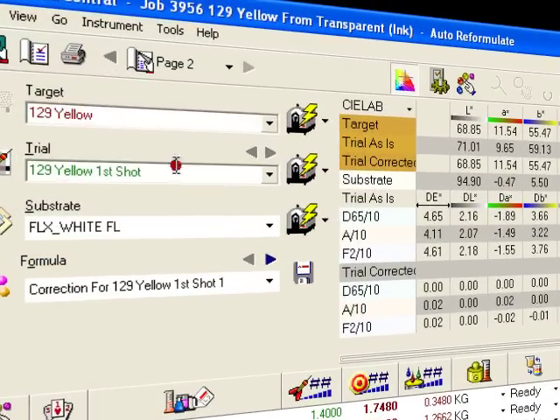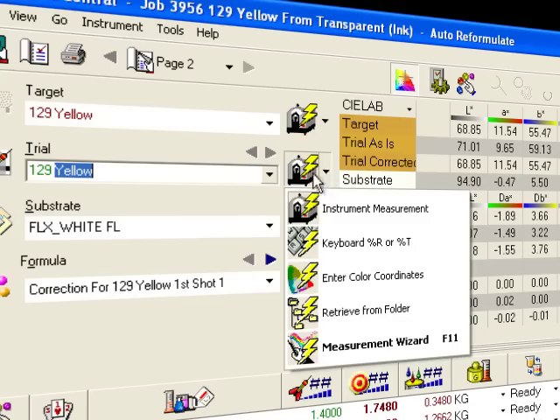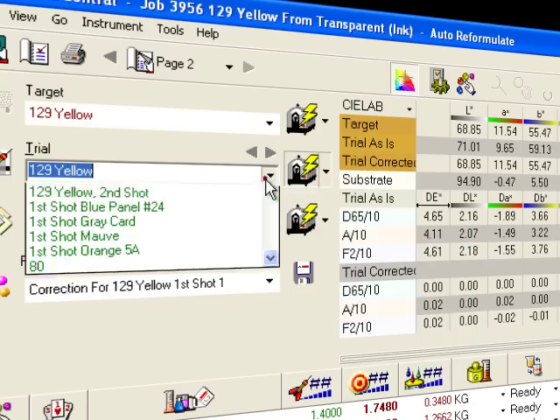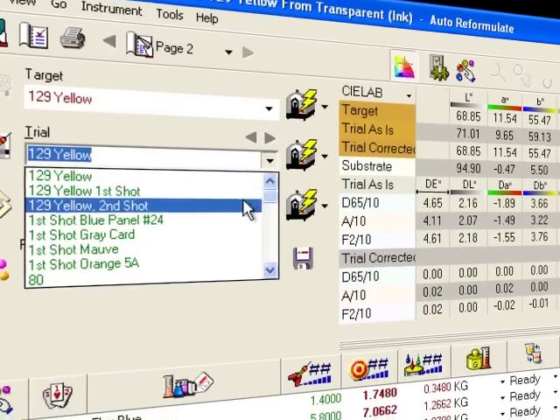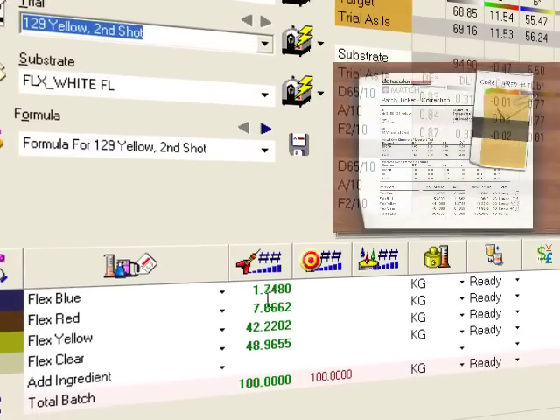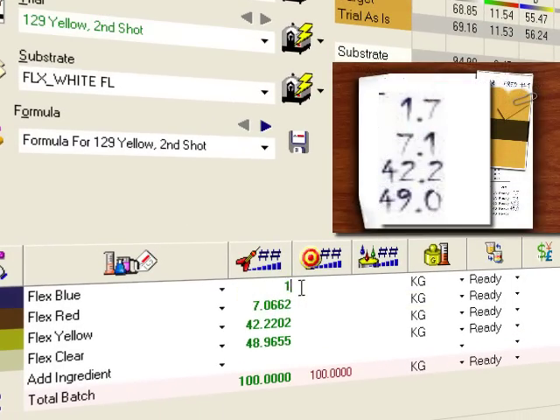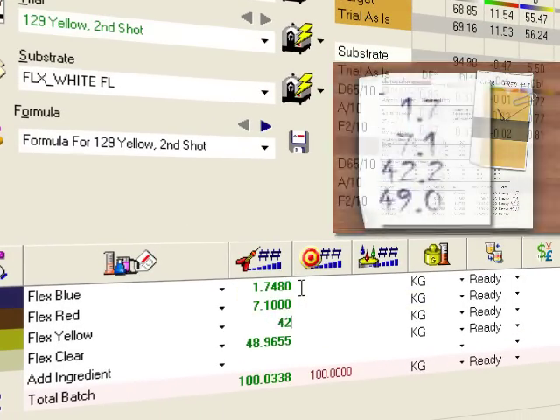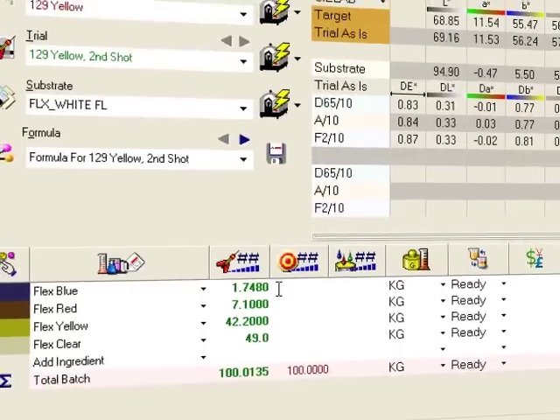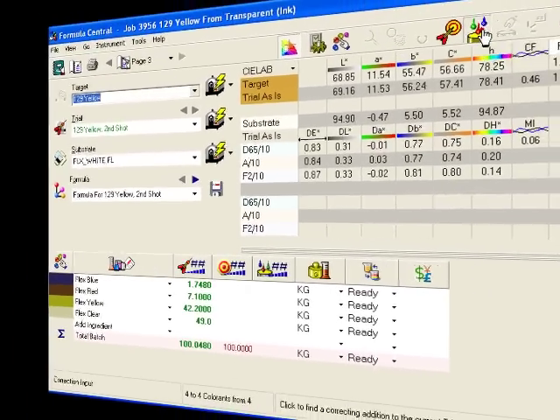Subsequent corrections work just like the first. Give the new trial a name. Then use the measure button or the drop-down. Verify the amounts in the formula grid.